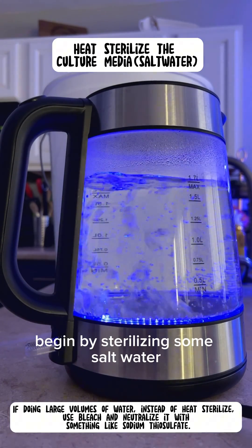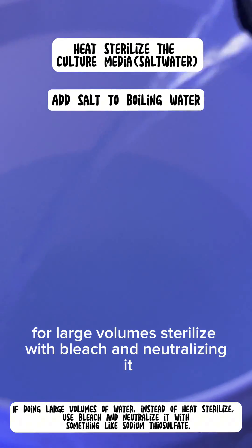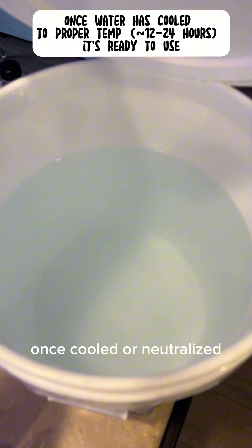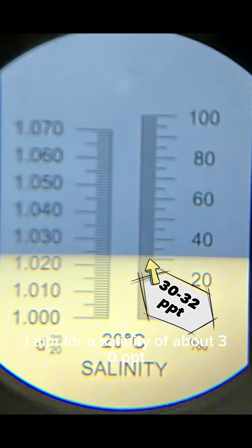Begin by sterilizing some salt water. You can do this with heat, or enlarge your volumes with bleach and then neutralizing it. Once cooled or neutralized, it's ready to use. I aim for a salinity of about 30 ppt.